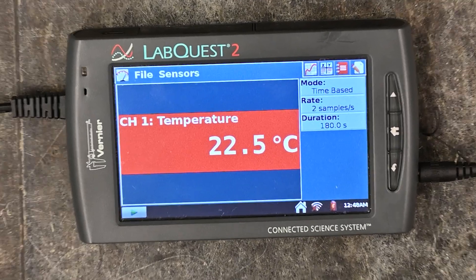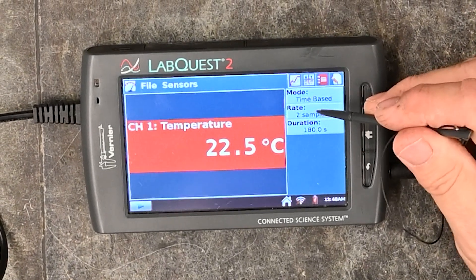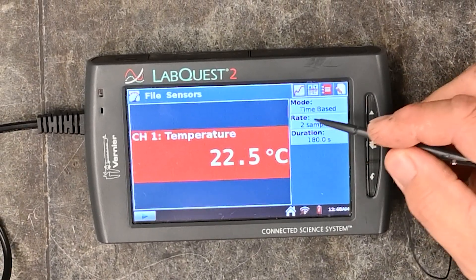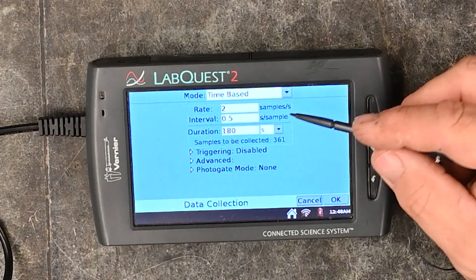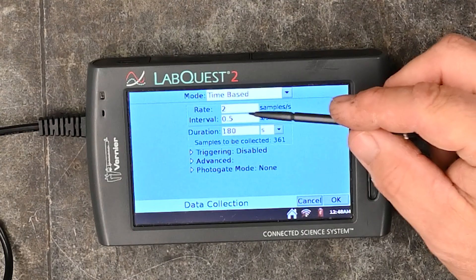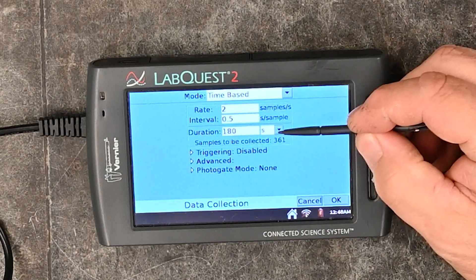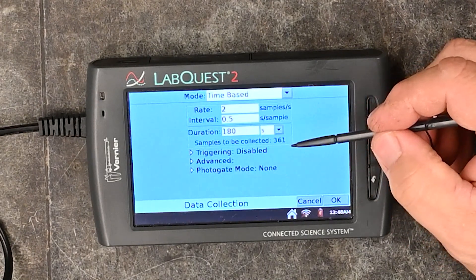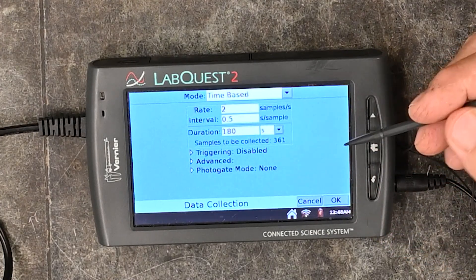Based on the lab you are going to run, you will need to adjust the rate at which it collects data. You do that by clicking the box that shows the mode, rate, and duration. Once you click on that box, you can adjust the rate, interval, and duration. You can set it to seconds, milliseconds, minutes, or hours depending on the lab you are doing.